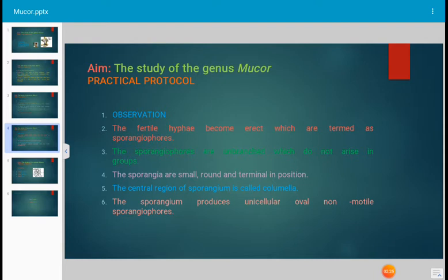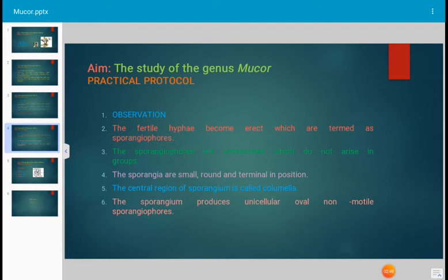Some erect hyphae are seen in the slide — these are the sporangiophores. Sporangiophores are fertile hyphae and are unbranched, which do not arise in groups. The sporangia are small, round structures that originate at and are situated at the top of the sporangiophore.